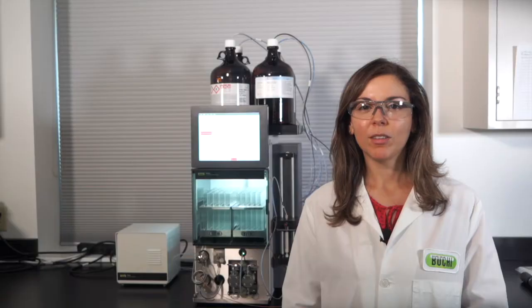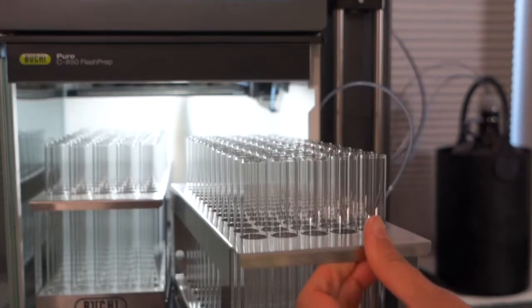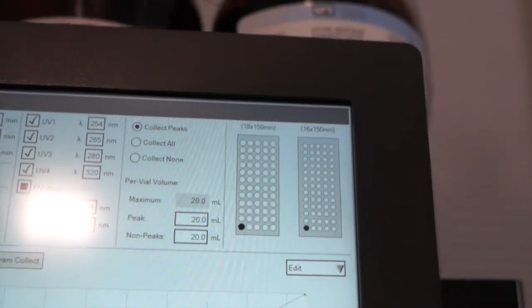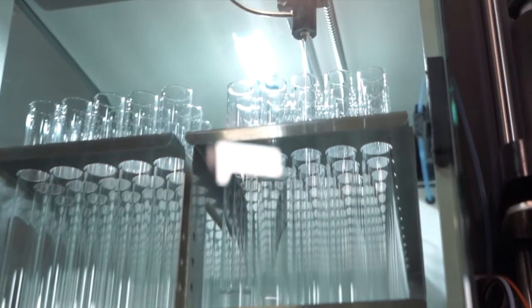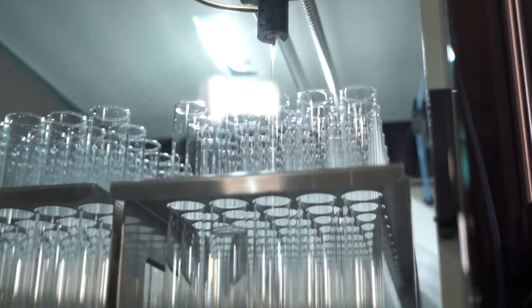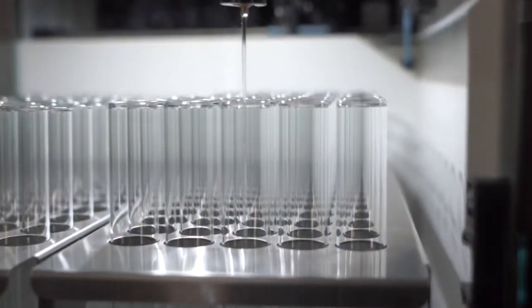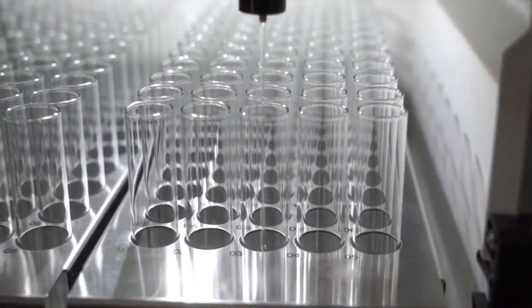Next, I want to show you the fraction collector. You can see we have a door where you place your racks. Each collection rack has RFID tag, which automatically scans upon loading to notify the system of the collection vessel being used. This determines the maximum volume of each fraction collected, but you could dictate smaller collection volumes depending on your application's need. This nice auto feature eliminates any human error and offers less clicks on the software.